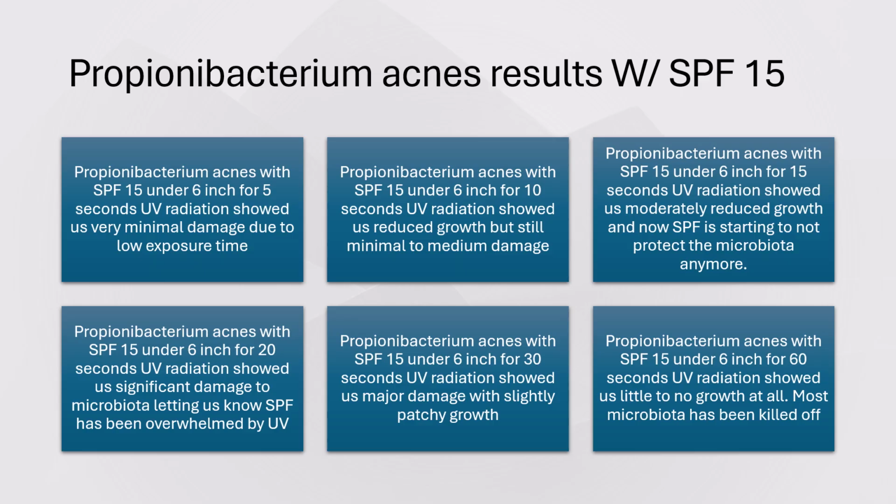And then we bumped it on up to 30 seconds, even after the 20 seconds had almost killed off a lot of our bacteria. We bumped it on up to 30 seconds. And this is where we saw major damage.